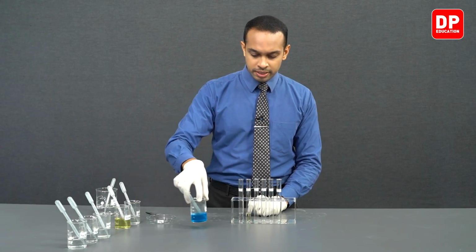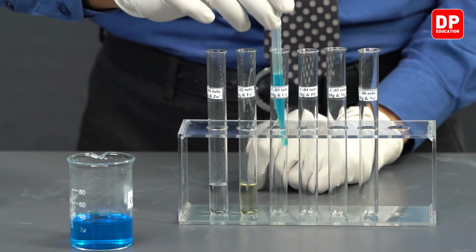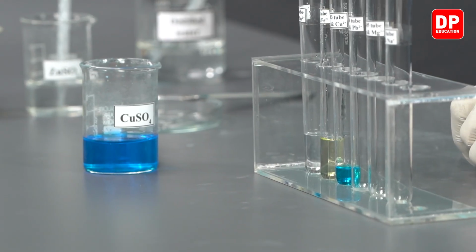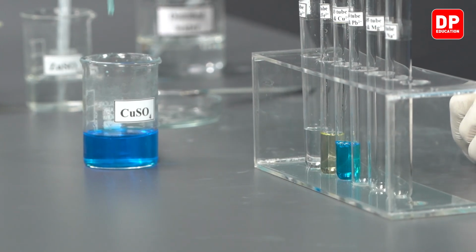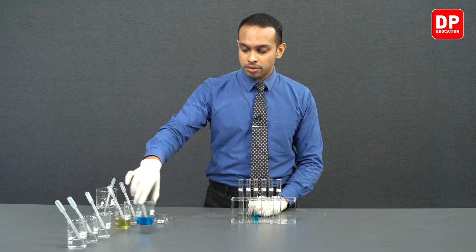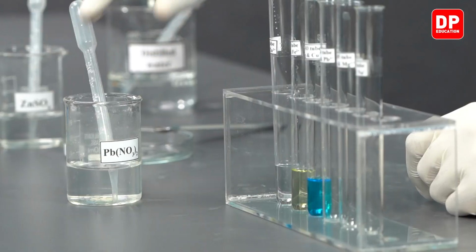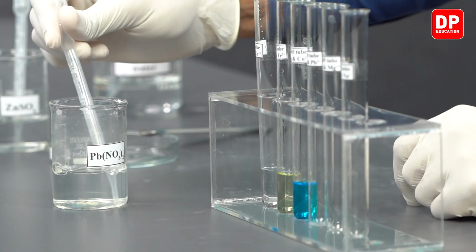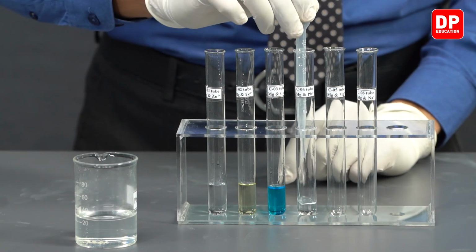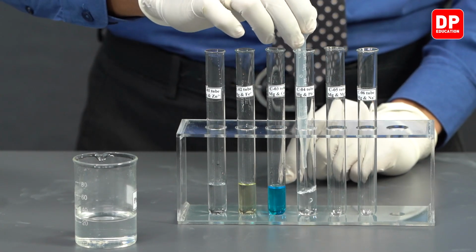We have copper sulfate here, and we will transfer around 5 milliliters of copper sulfate into the third test tube labeled copper 2 plus ions, and then we will move on to lead nitrate. We have a test tube, or we can say C4 test tube, labeled Pb2 plus. So we are adding lead nitrate solution into that test tube.